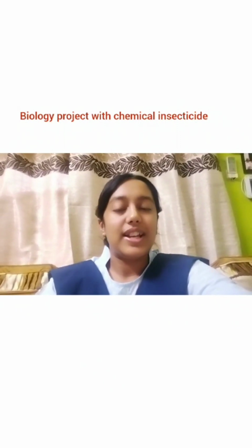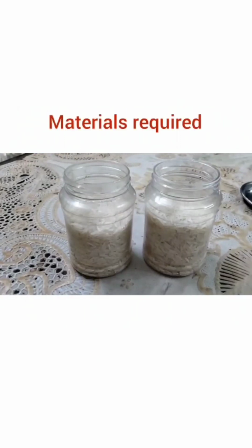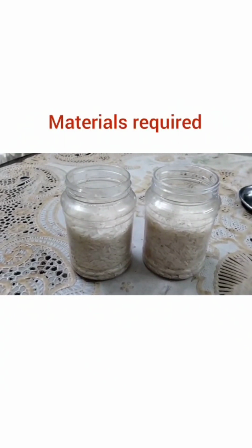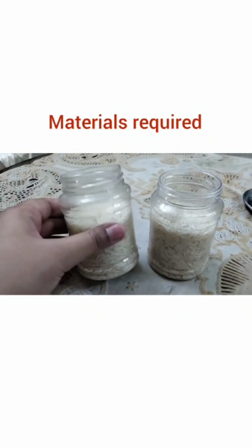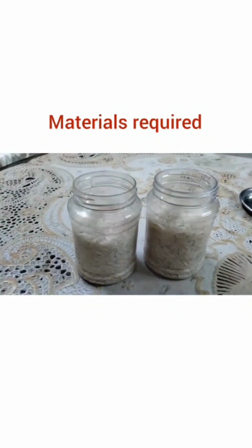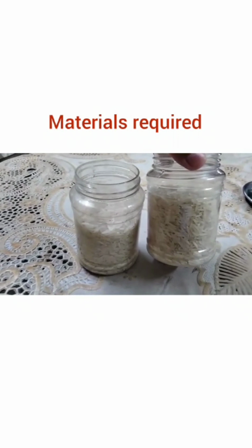So today we are going to start the experiment of comparing insecticidal effects of dried powdered material of indigenous plants with chemical insecticide against Sitophilus oryzae, which is commonly known as rice weevil. So let's get started. Let's have a look at the materials required. Here I have taken 50 grams of fresh basmati rice in two transparent containers.